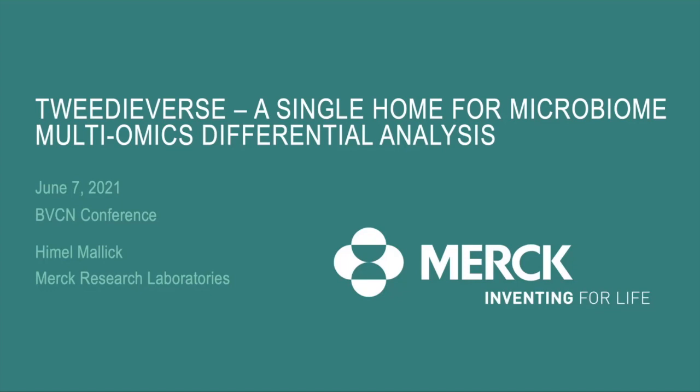So I'm going to talk about, and I'm very excited to talk about my new tool, Tweedieverse, which is a general purpose differential analysis tool for microbiome multiomics data.